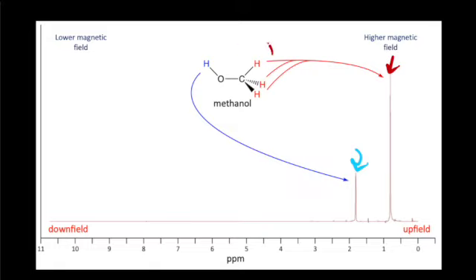We take some methanol, and we have big electron clouds around these three hydrogens. And they're all equivalent. They all are in the same chemical environment, and they all have the same amount of electron clouds around each of those atoms. In those, the little hydrogen magnets had a lot of electron cloud. So there's my little hydrogen magnet. We had an electron cloud, which opposes that. It got smaller. So we had to increase our external magnetic field, increase it, increase it, increase it. And at this magnetic field strength, it starts to flip.